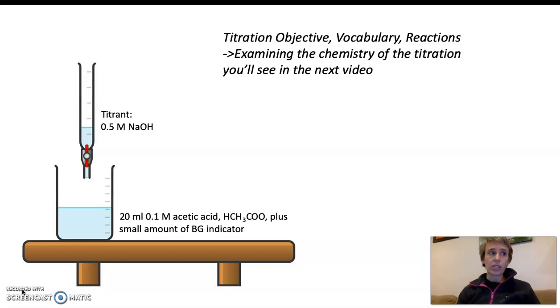Typically, titrations are all about really careful volume measurements. We often use a burette tube, which is a very careful measuring device. I'm not going to be using the burette tube in the procedure and results video because my goal is not to quantify anything about the acetic acid. The only purpose of titrating the acetic acid here is for its buffering capacity.